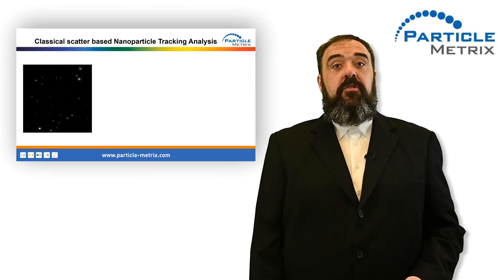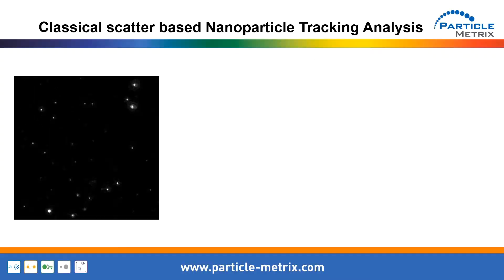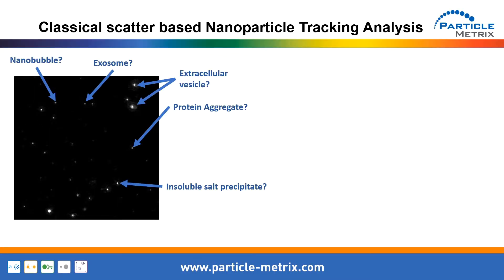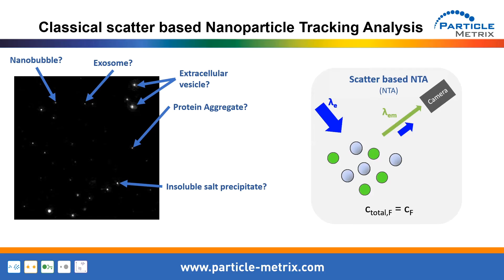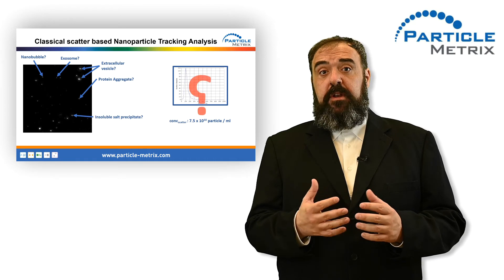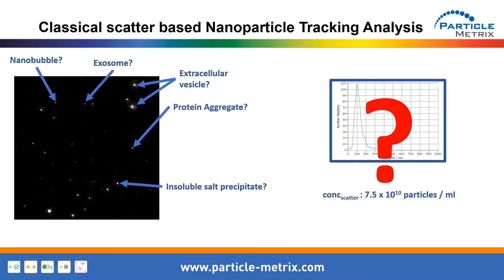This is a representative video image of a scatter-based NTA result where many people might wonder: what type of particle do I see in my sample? Is this signal really an EV or an exosome? Or is it just a nanobubble, a protein aggregate, or an unspecific inorganic salt precipitate? You simply do not know. But this is exactly how classical NTA works. All particles in a sample are illuminated by a laser, all particles scatter light which is detected by the camera and analyzed. So all particles, no matter what they consist of, are part of the analysis. It is not correct to call a size histogram containing all those unknown particles an extracellular vesicle distribution. And more importantly, if you are only interested in the vesicles in your sample, using all these signals for calculating the concentration will result in an overestimation of the real vesicle count.